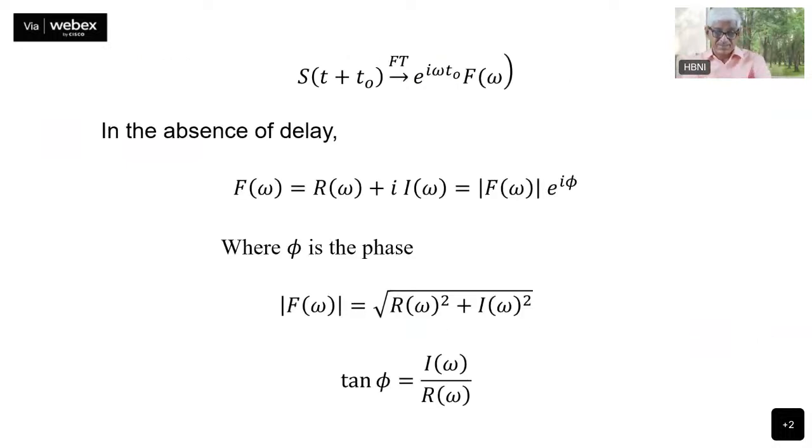Now this requires a little bit of mathematics and algebra to see how one can correct this. So let us look at this. You have a delay in your data. I'm sorry, I'm using different symbols at different times. So here is T naught. Previously I put a delta, and earlier I put a delta T. But you may be clear about what I'm trying to refer to.